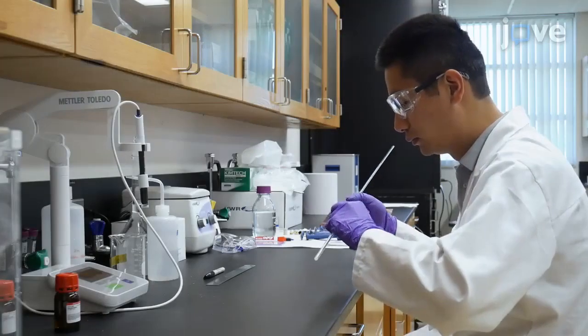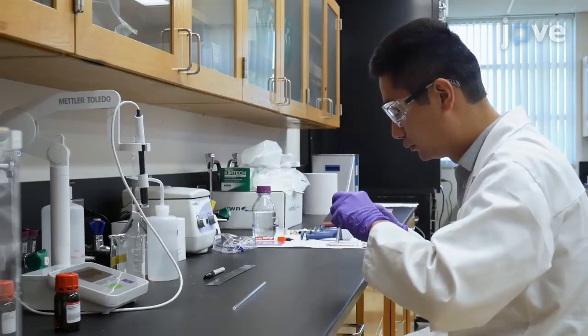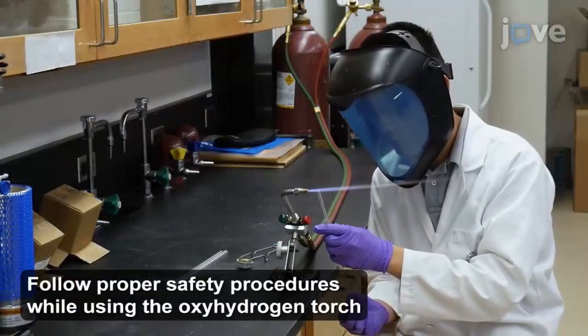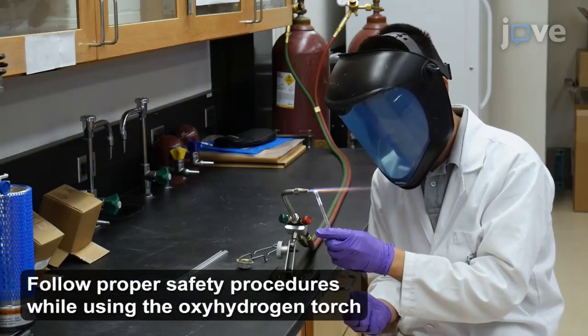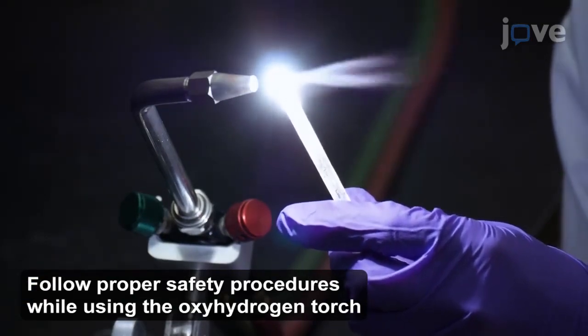Using a tube cutter, cut the tubing into small pieces about 30 centimeters in length. Then, use an oxyhydrogen torch with an appropriate flame head to seal one end of the tube closed.